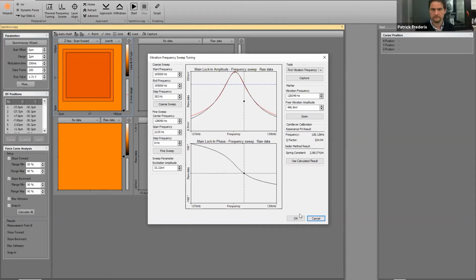Yes. So currently the last question in the queue. What kind of mechanical properties exactly could we get by doing spectroscopy? For an elasticity map, you can get an E module of the sample.